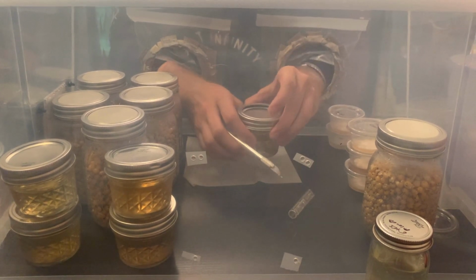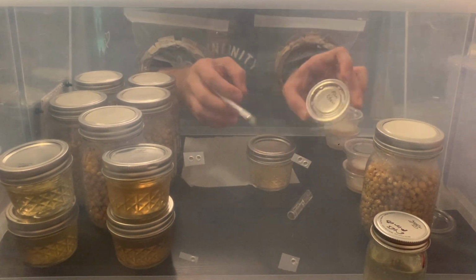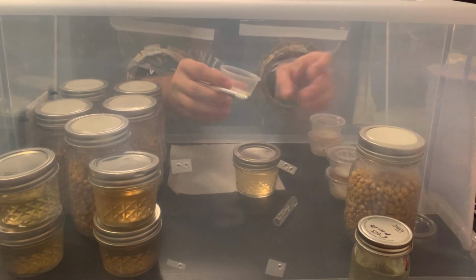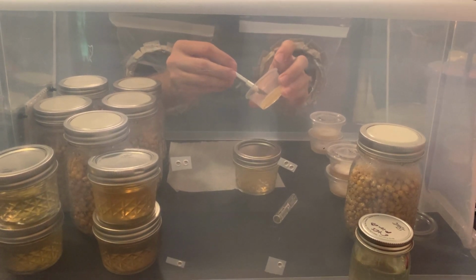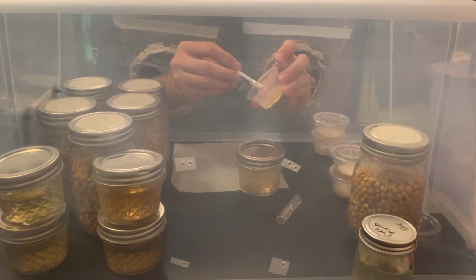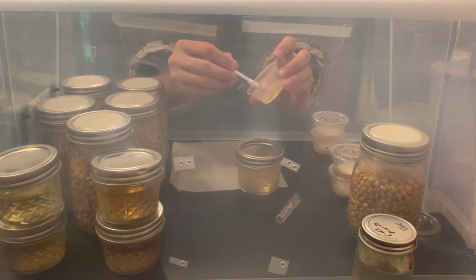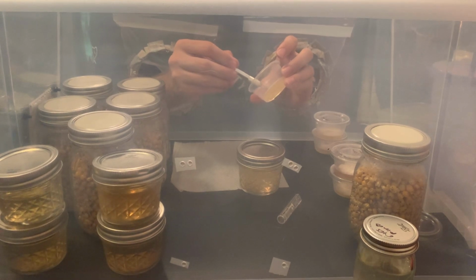So you're just gonna open up your jar a little bit, be right there, and get your culture, spore syringe, liquid culture, whatever you're gonna put inside of your jar. You're gonna wanna move as still as possible here. And then there kind of is a little bit of a science to this. I'll make a video on this at some point, sectoring, but for now, you can kind of just cut any piece off.